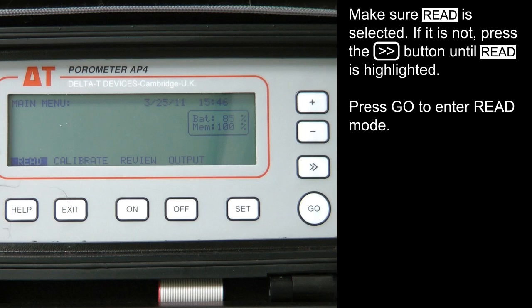Make sure Read is selected in the main menu. If it is not, press the right arrow button until Read is highlighted. Press Go to enter Read mode.